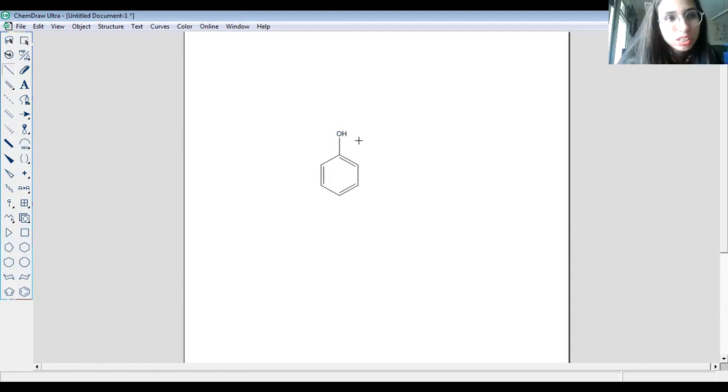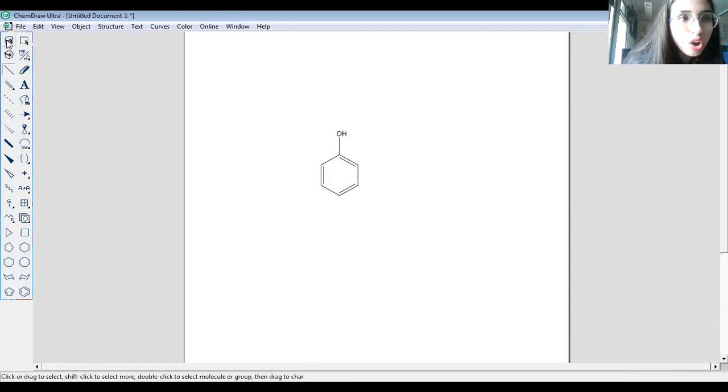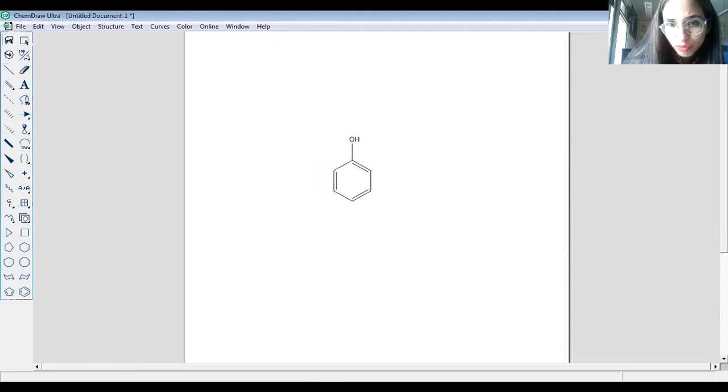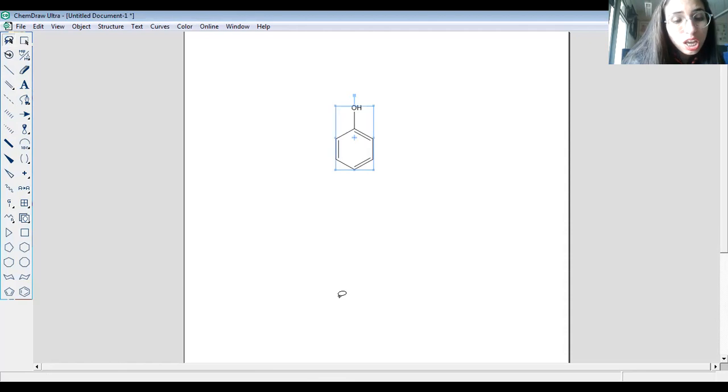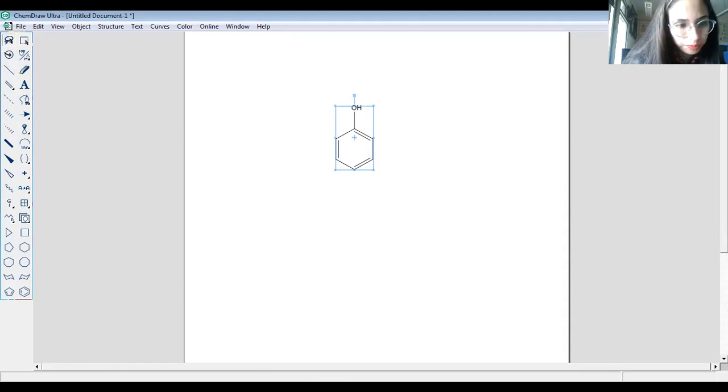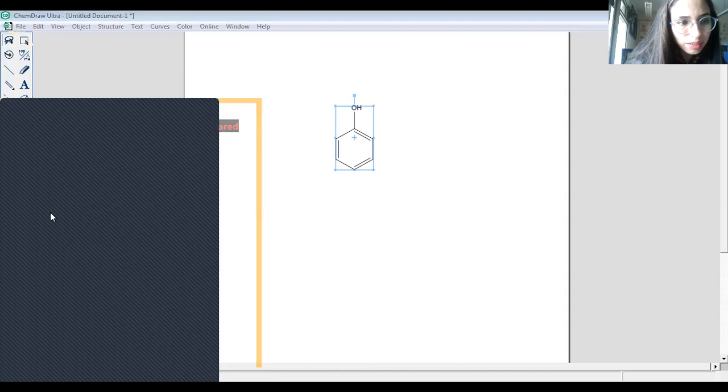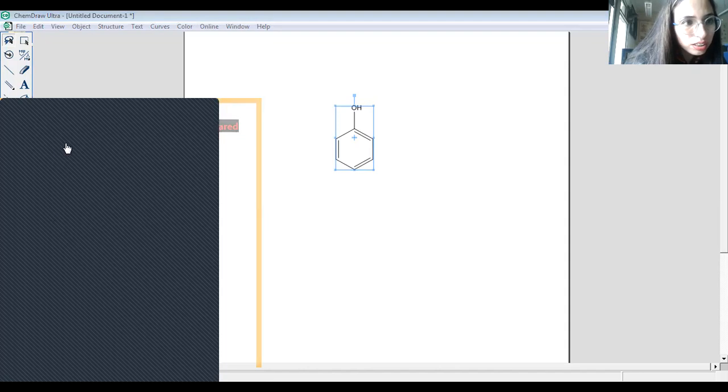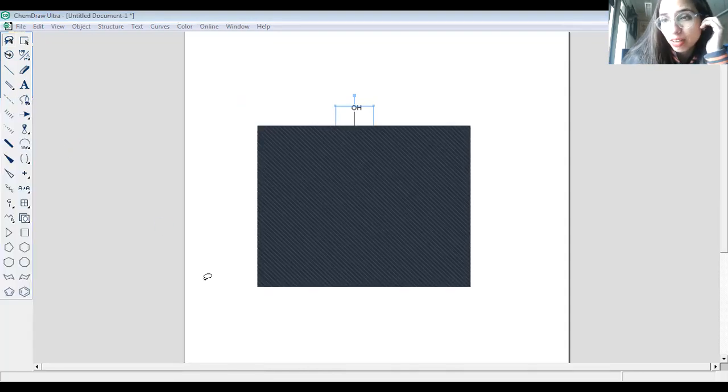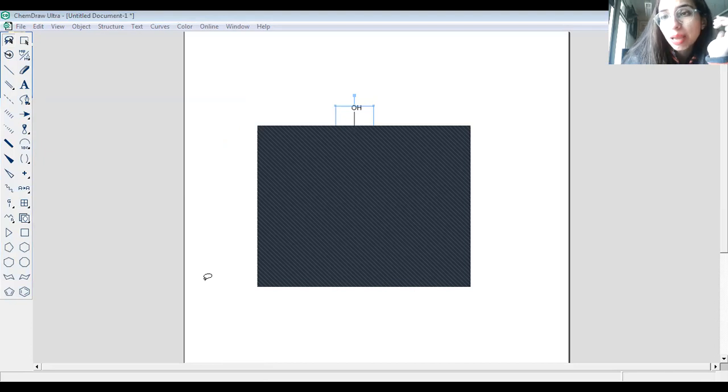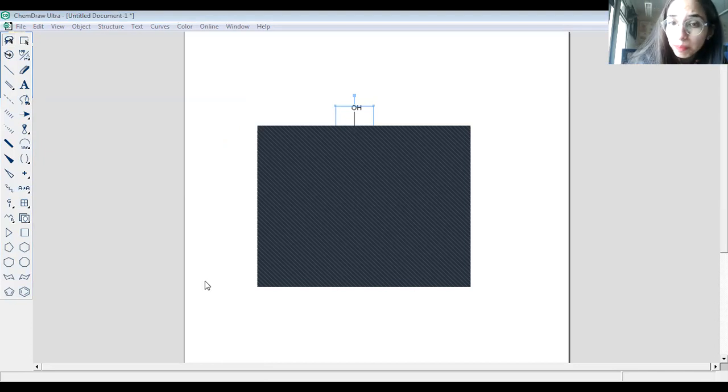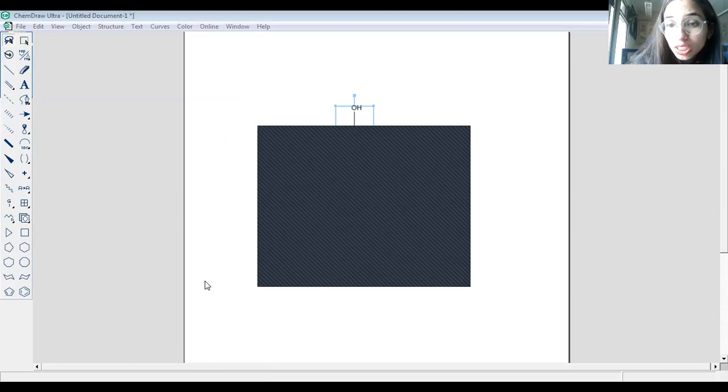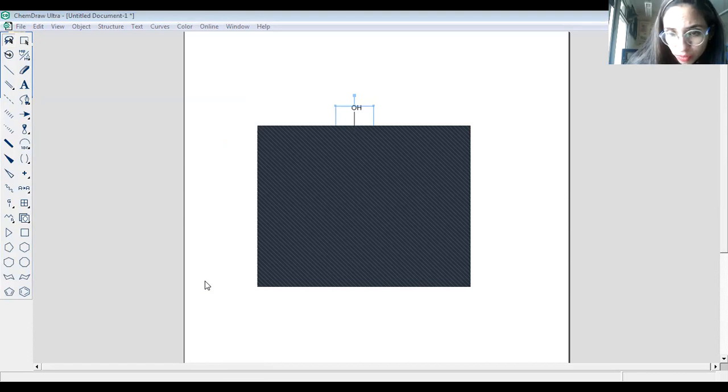Now I'll tell you the difference between 2D and 3D. You will see, this is all about the X and Y axis. Now I copied it. You can see another feature of the software like ChemDraw. There are a number of features that are helpful to draw the 3D structure also.